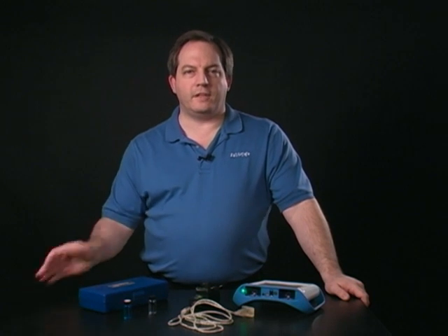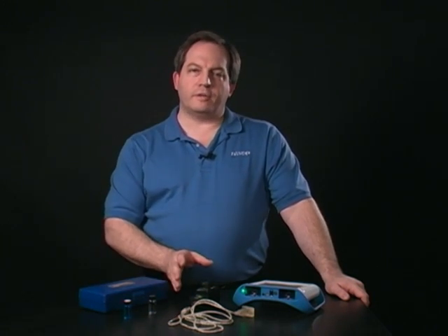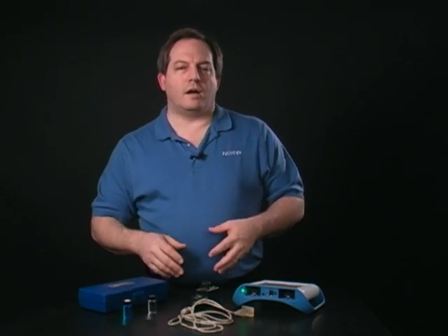Hello and welcome to this quick look at the colorimeter. The colorimeter is used for measuring the amount of transmittance or absorbance of light through a particular sample. What's interesting about our particular colorimeter is that we use four different wavelengths of light and it measures them all simultaneously.